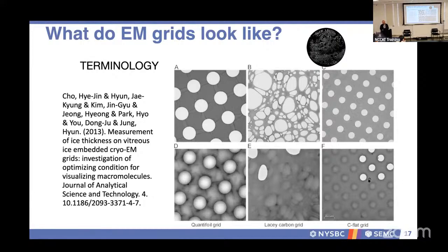Some people now use multi-size hole grids because they don't really know what their target is. Ideally, if you have a very defined target, it's very straightforward. You have the full protein sequence and you're good. But what people are going after now are complexes or different types of complexes with different sizes and different conformations.